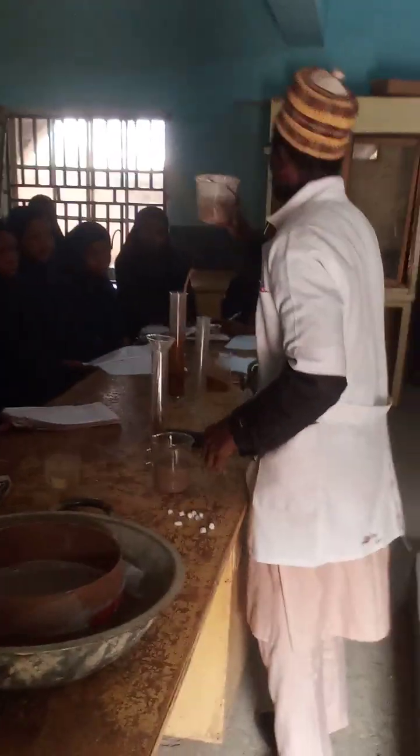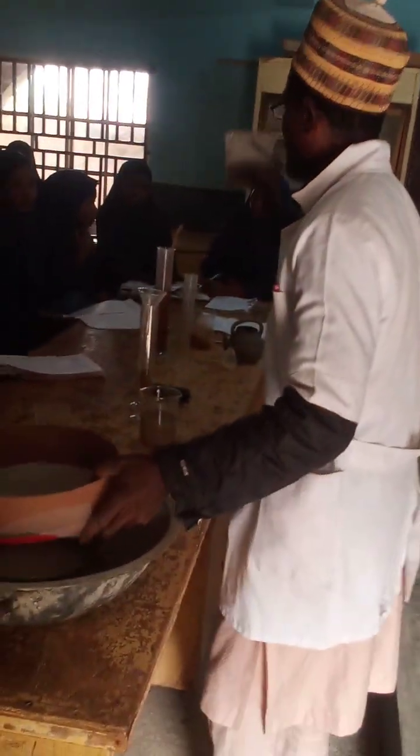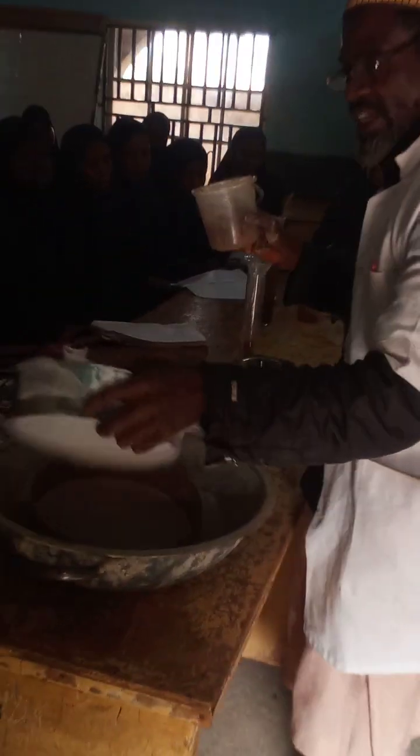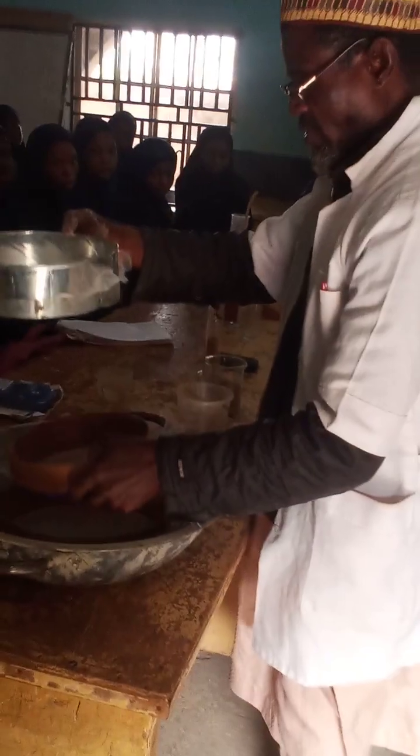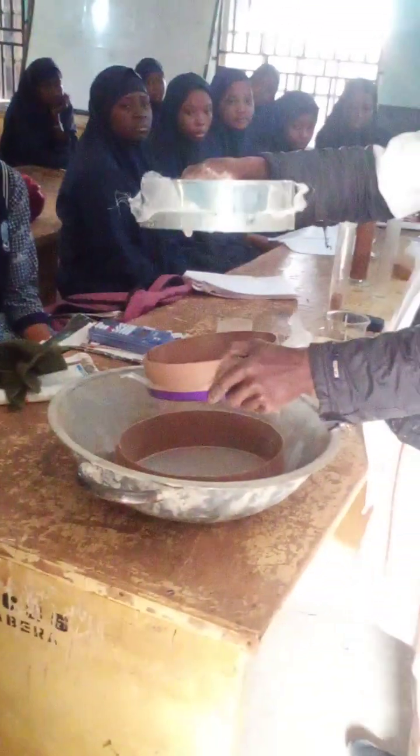So it means that you are going to take a weight of the soil sample. You are going to weigh it, and this one has been weighed in the chemistry lab to be 50 grams. After taking the weight of the soil sample, we'll pour it on the sieve of the largest diameter first. It's the one that is going to be on top. Put this inside now, like this.